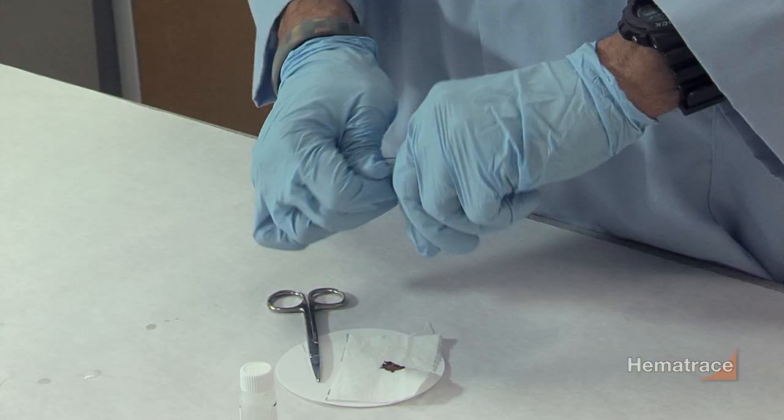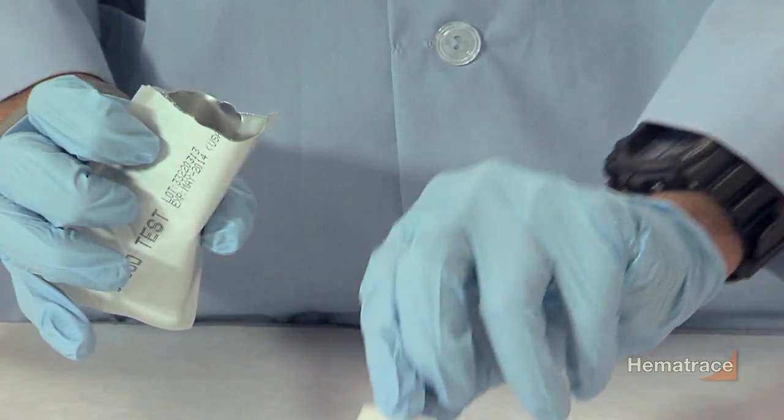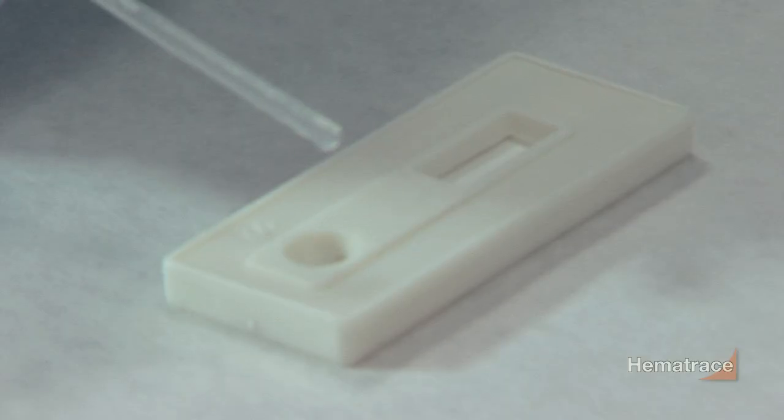Open the pouch provided and remove the test card and dropper. Label the card with the appropriate information. Using the dropper, draw up the extracted liquid and place four to six drops into the S-well of the test card.